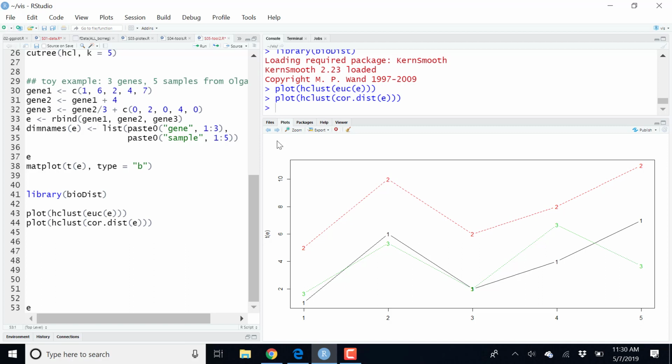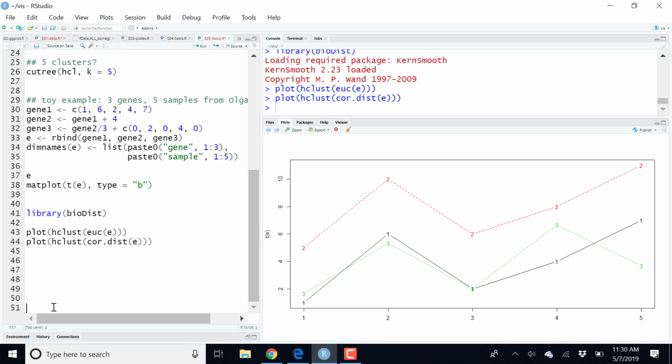So this is to show that in clustering in particular, but in general, in many different algorithms that we are going to use, exactly how we process our data, what kind of assumptions are made about the data will influence our results. And certainly when we have thousands of genes that we look at, we want to have a big picture, but there is no way we can start to pick apart cases like this. And so typically what we would want to do is to scale our data.